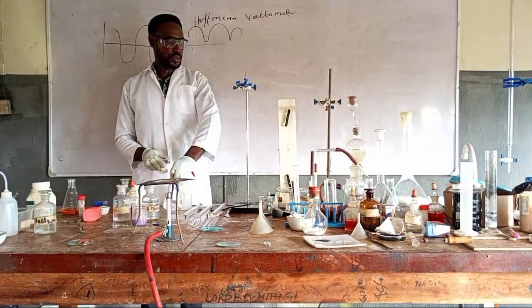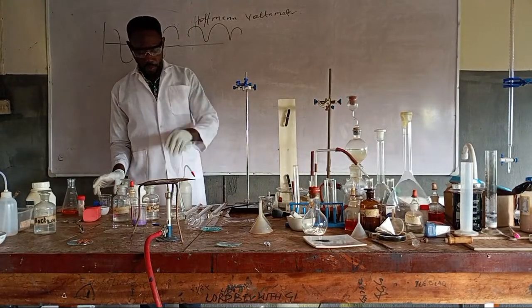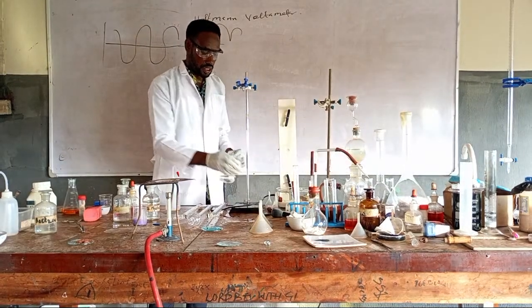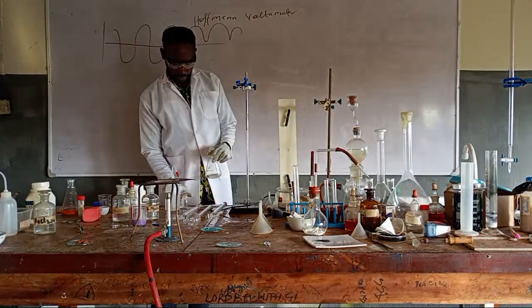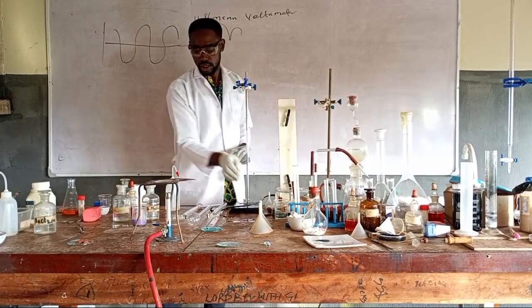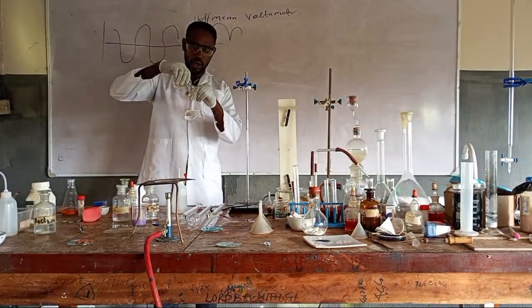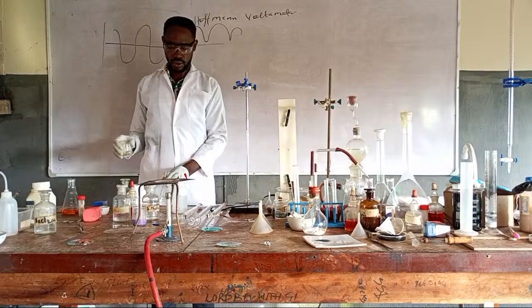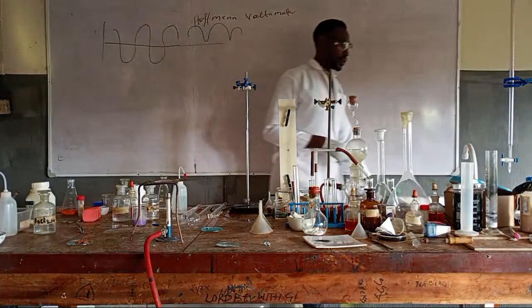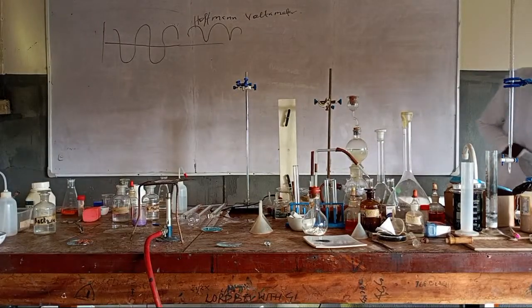We will use it and perform the experiment, which is creating sugar charcoal. We are doing carbon and this compound, right? Yes. And then charcoal is one of the, is it amorphous or crystalline? So the purest form of amorphous carbon is sugar charcoal. So I want to create sugar charcoal with this concentrated H2SO4 so that you will not run the risk of it falling on anybody.